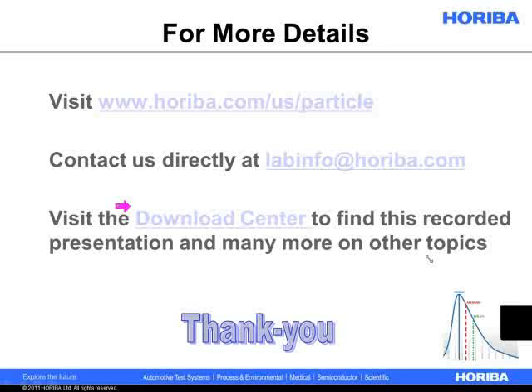And ideally, a lot of samples will have some range of transmittance values where you have enough scattering going on to activate all the relevant detectors at all the angles where you're going to get good size information without adding so many particles that you start getting into multiple scattering. That's a drawback of adding very concentrated sample into the analyzer: one drop could take you all the way down to 60% transmittance. In that case, you have to use the analyzer's auto-dilution controls maybe, to auto-dilute it back up to a good transmittance range.